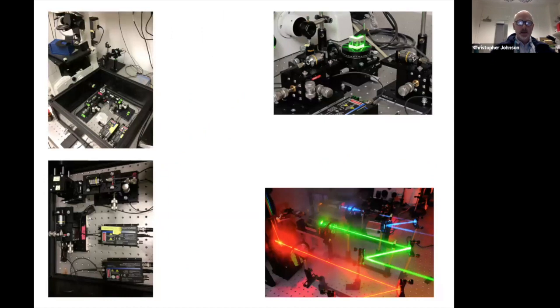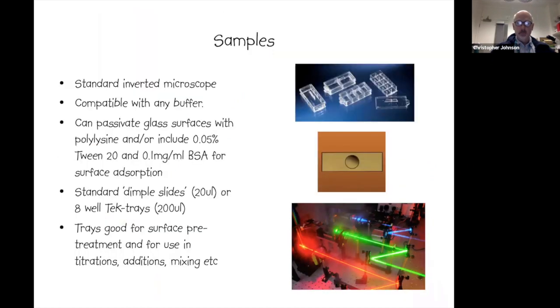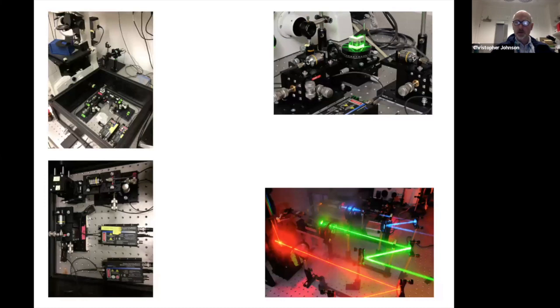So here are some pictures of the actual instrument. And in fact, behind me on this side, you can just see the eyepiece of the microscope as I'm talking from this confocal room today.